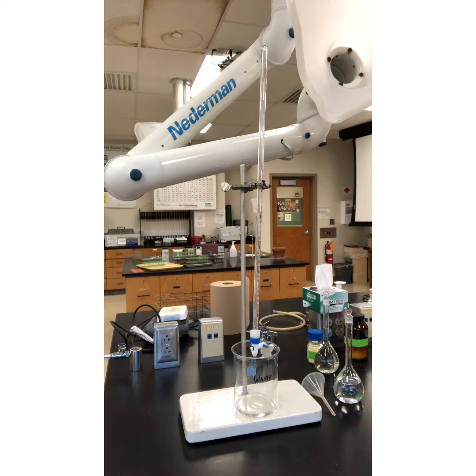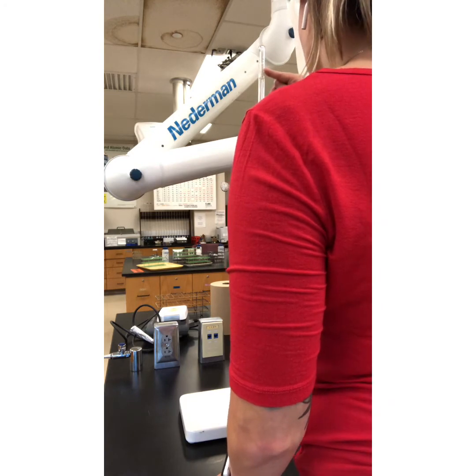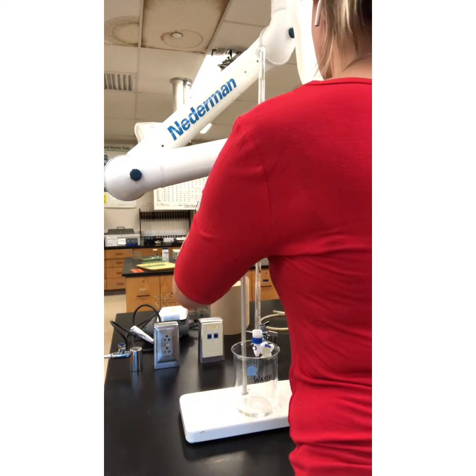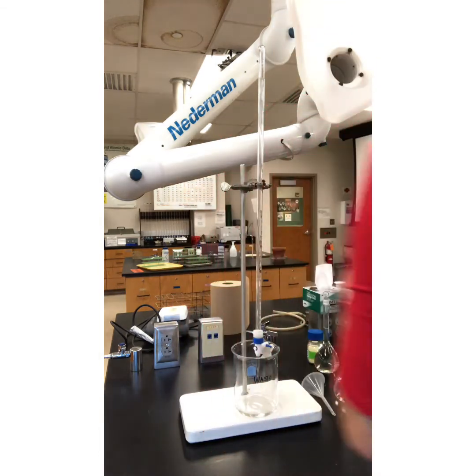All right, that is it for part C. We've filled our burette. Let's see if I can take a reading. I'll do it when it comes to that one. Let's not skip steps, huh? Let's go in order, so that the report goes in, or your handout goes in.